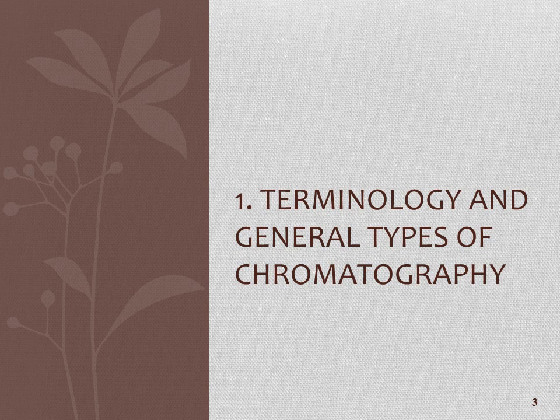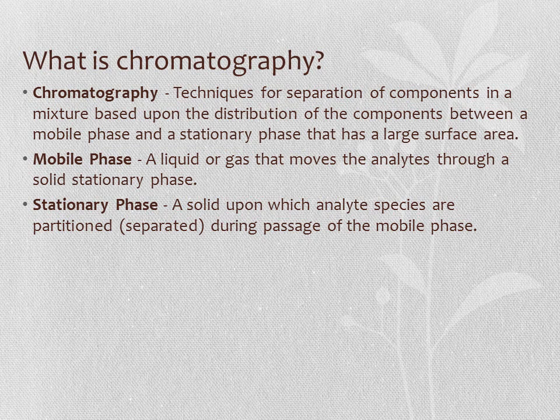So what is chromatography? Let's start with some terminology and a discussion of what the general types of chromatography are. Chromatography is simply a fancy word for separation of molecules. We have a mixture of components, usually chemicals, biological species, medicines, metabolites of medicines, and we want to separate them. We do this by passing them over a stationary phase, which is usually a solid or liquid, and we have the molecules carried by a mobile phase, which is then usually a liquid or gas. It is the distribution of the components in between these two phases that causes our separation.